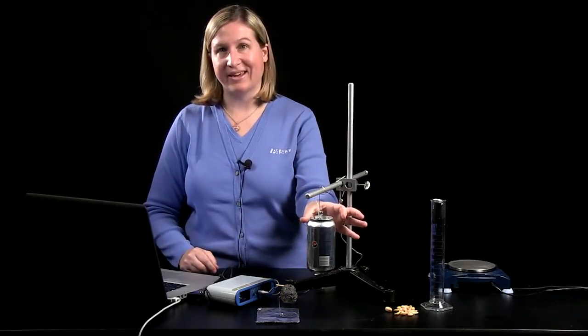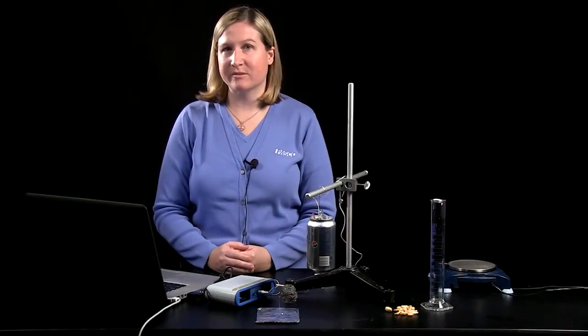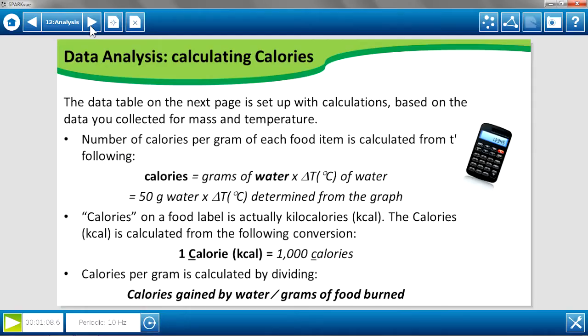It's important if students are doing this lab on their own and they're burning more than one food item that you remind them the can is going to be quite warm, as warm as the maximum temperature that the water reached within that can.